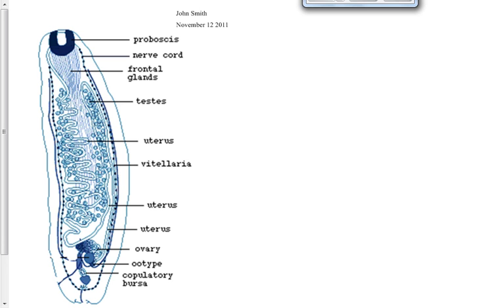All right, listen up here, guys. So you've got your diagram there, your example of a proper lab diagram. So a couple of rules on drawing a proper lab drawing. First off, they're really, really anal about this at university, so you really want to do this right.